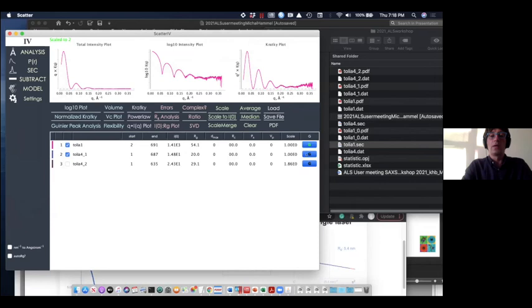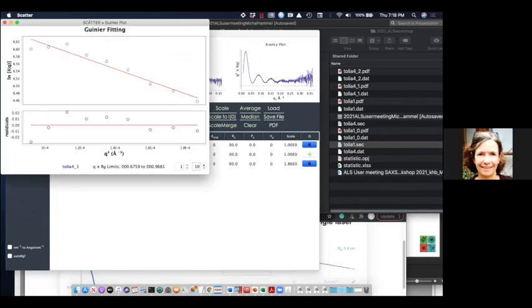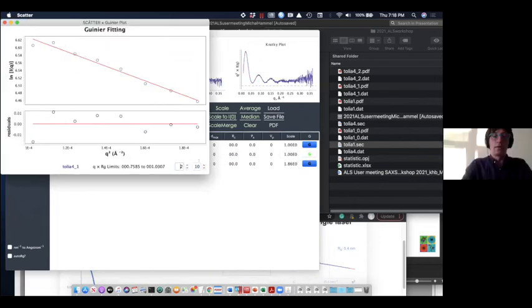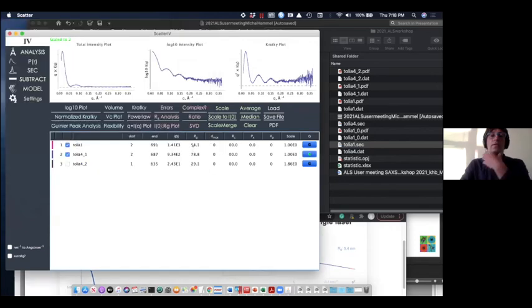Okay, so I will just respond to fast questions today from the user. And so you can confirm that your apoferritin has an RG of 54, which is exactly what was deposited from a different group, versus RG 78, and obviously you have the complexation.